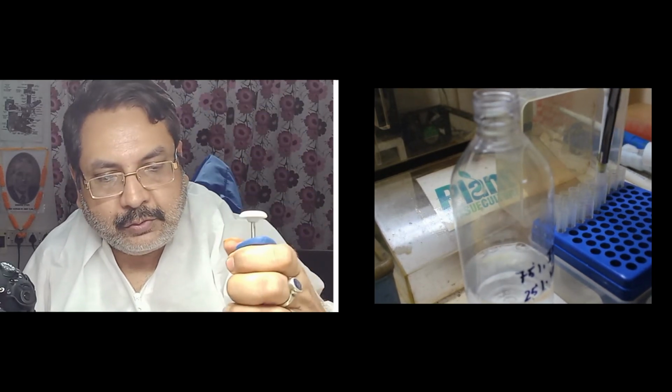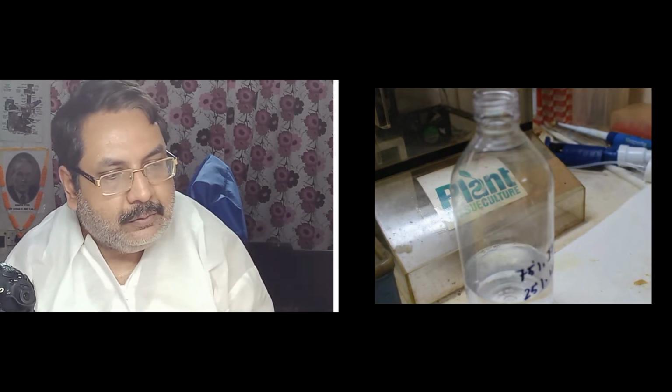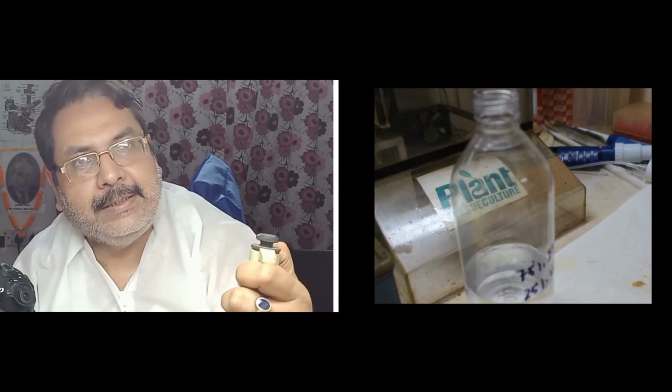So now we are going to see the other auto pipettes. This auto pipette is over. So this is a small auto pipette. This is the same, just everything is the same. So this is our plunger. This is the tip releasing plunger. This is our volume plunger.